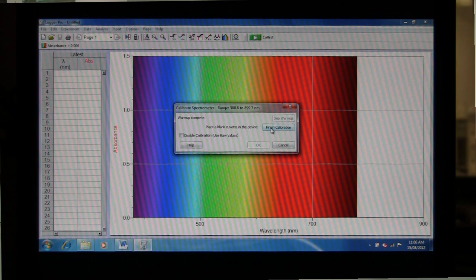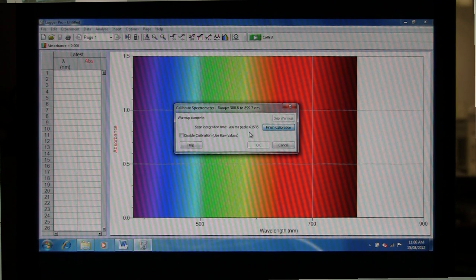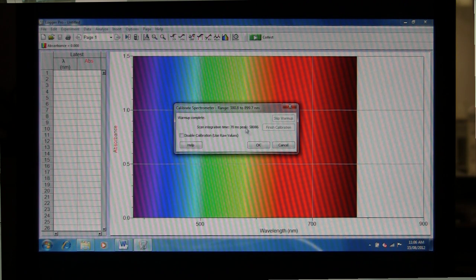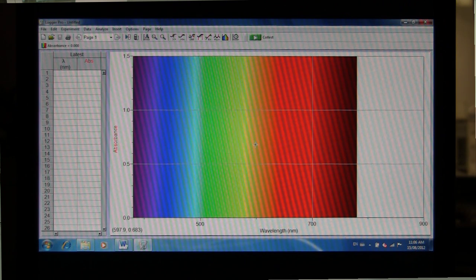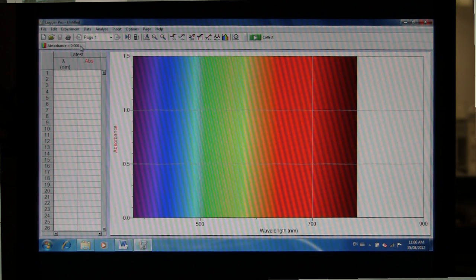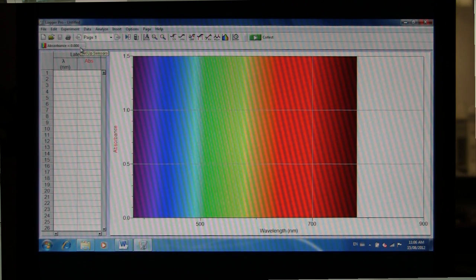Then click on Finish Calibration. It will just take a few seconds to initialize. And then click OK. And then you'll see in the display in the corner that the absorbance is more or less zero.